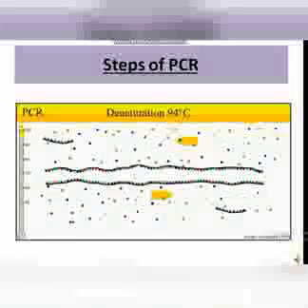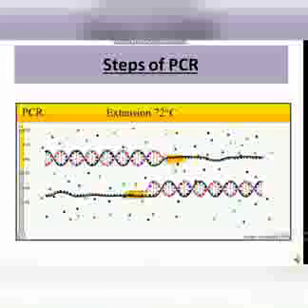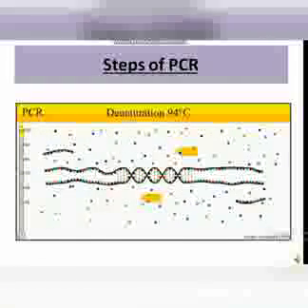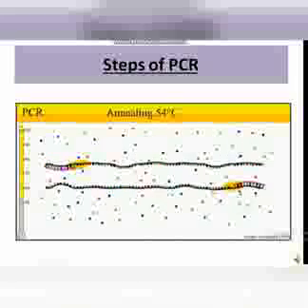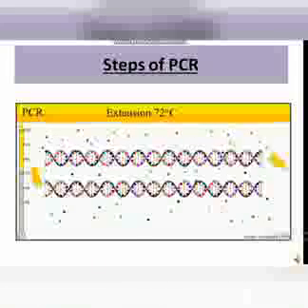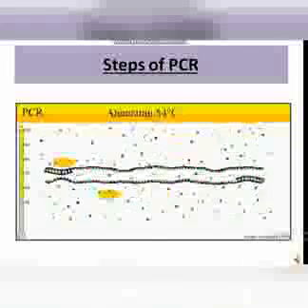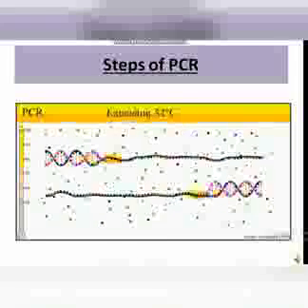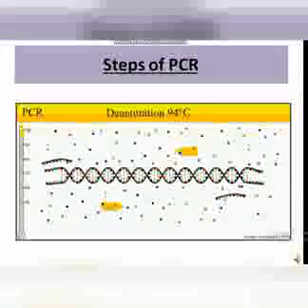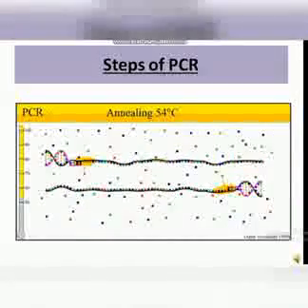To understand RT-PCR, it is important to keep in mind the steps of PCR, because RT-PCR has the same steps as PCR but with a little bit of modification. There are three steps of PCR: denaturation, annealing and extension. Denaturation, in which double-stranded DNA is heated to separate the strands. Annealing, in which short DNA molecules called primers bind to the flanking region, the region of the DNA which is adjacent to the 5' end of a gene of a target DNA. Extension, in which DNA polymerase extends the 3' end of each primer along the template strand.